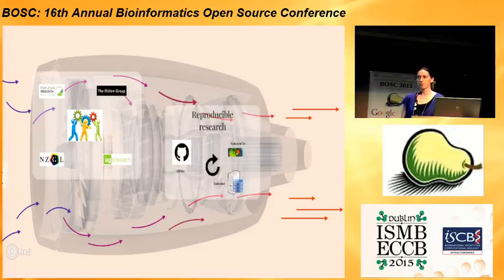We've always talked about reproducible research, which I'm not going to go into in too much detail, but that's something that's really important to us: that we can redo the same thing that we've done before. If I go back to something I did six months ago, I won't be able to rerun it the same way if I don't have something robust to rely on, a proper workflow framework, whatever the word is for this.